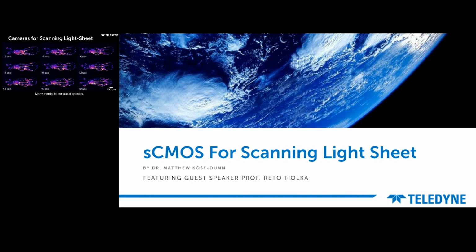Many thanks to our guest speaker, Professor Reto Fiolka, for providing his expertise and some great context surrounding scanning light sheet and the light sheet landscape in general. For the next part of this webinar, I'd like to talk about camera technologies and how they can serve scanning light sheet. As Professor Fiolka mentioned, the rolling shutter is vital, as well as the concepts of multiple rolling shutters or multiple regions, adding to the power of light sheet through parallelization.